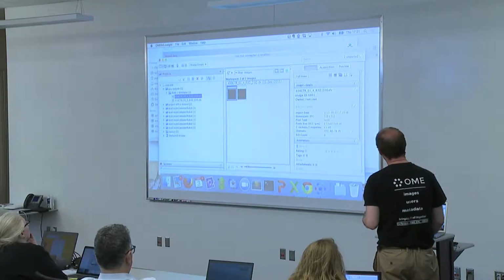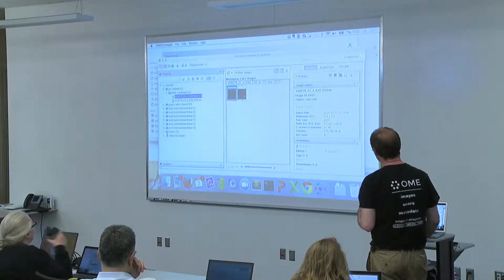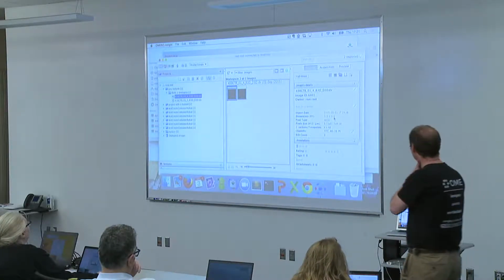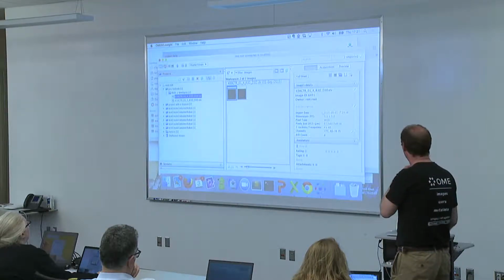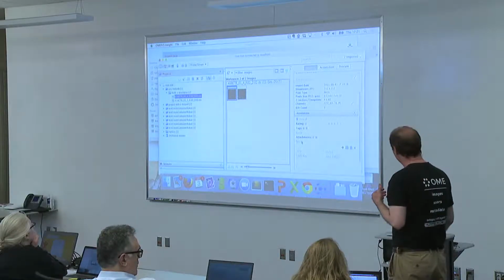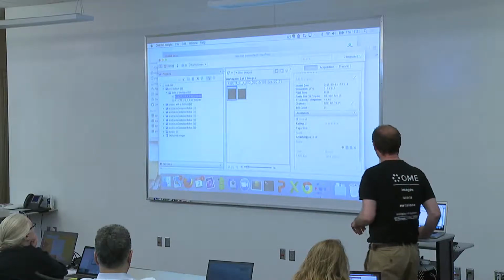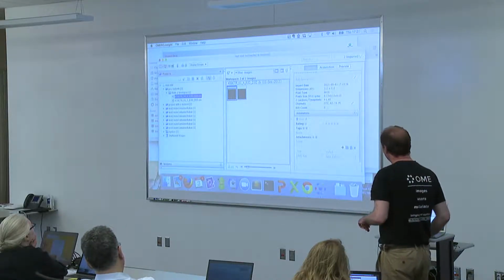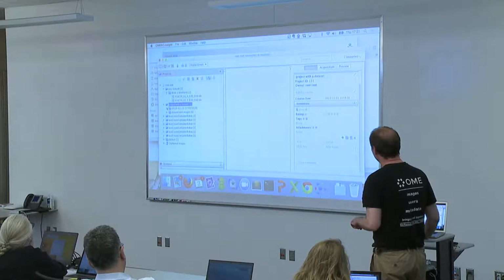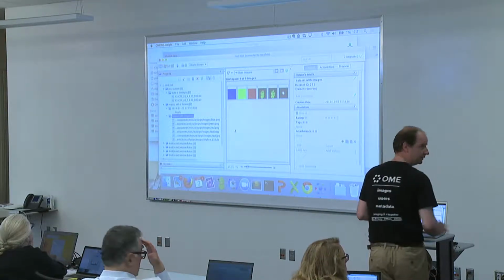Now, these are the metadata I was talking about. I have here a middle pane where there are thumbnails of the images. And the most basic and important, like the type of the images, name, pixel size, and so on, are here. Further, there are attachments and tags which are quite important for the management. We are delivering two levels of hierarchy, the project and the dataset under which are the images.